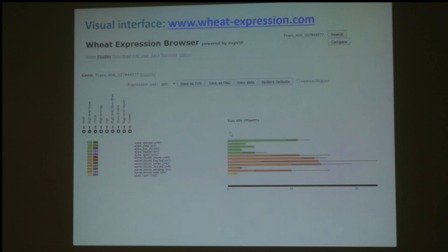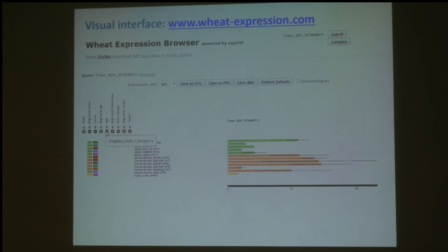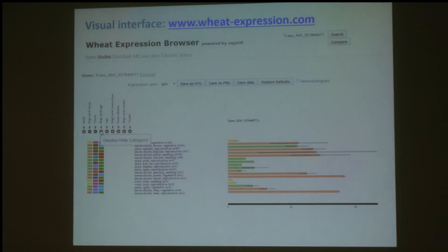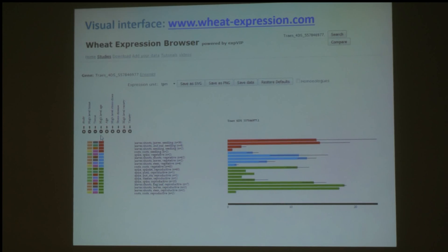We can hover over particular bars to look at the expression level. In this case the expression is 11 TPM — transcripts per million — which is normalised across different studies. We can add in extra categories, such as the age of the plants, and you can resort according to the new category. The bars will be recoloured according to the new category to allow easy comparisons.